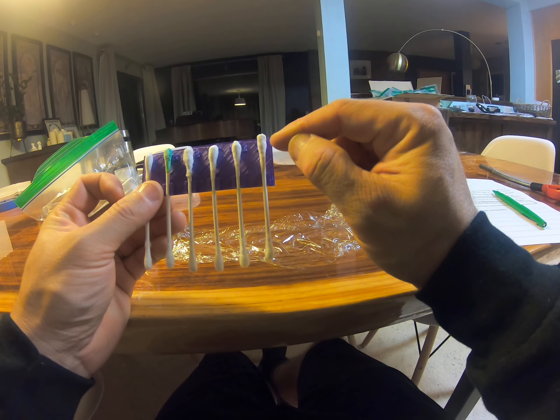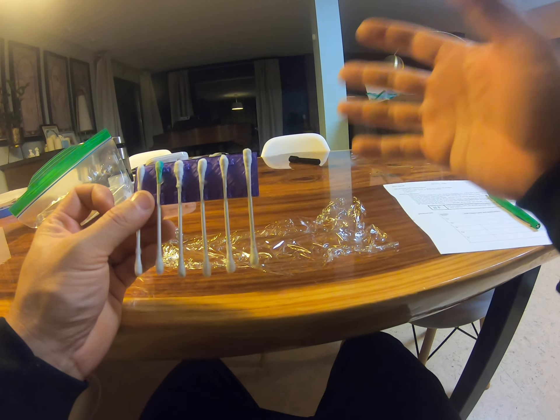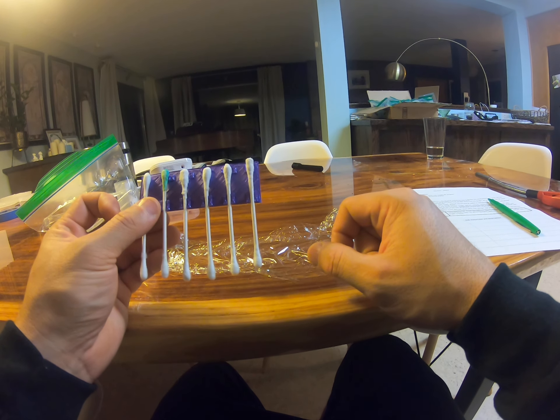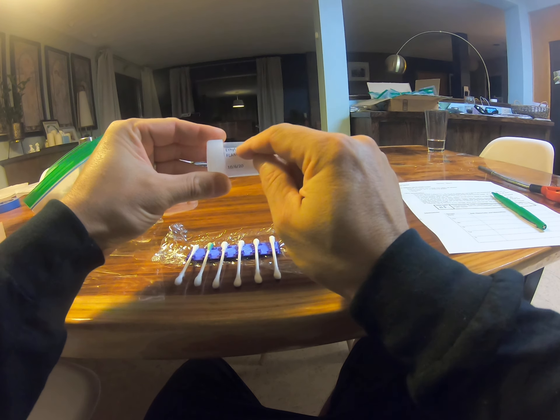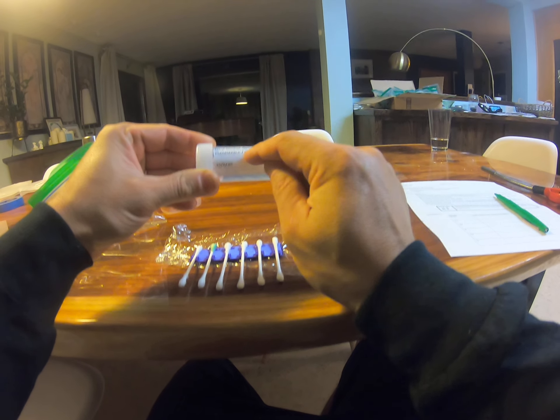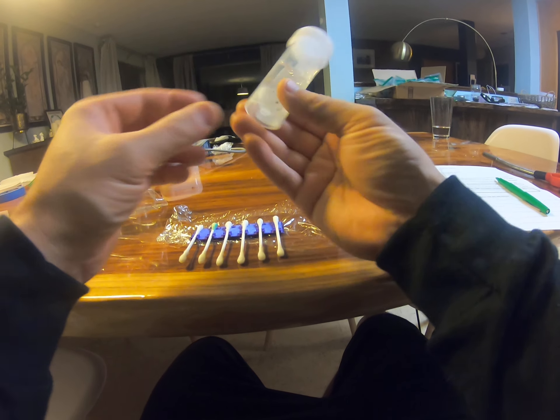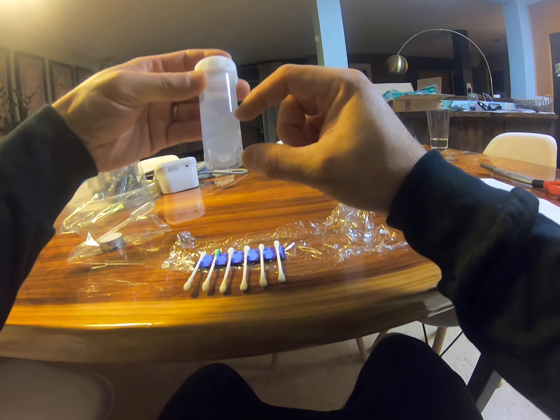And then these are our five samples: I have copper, barium, strontium, calcium, and lithium. That says CU for copper. You want to try and keep them in order so you don't mix them up. It's pretty easy to know which one's copper, but the other ones — most metal salts, most ionic compounds in chemistry, are white crystalline substances. So it's really hard to tell them apart. Please keep them in order. That's why I've got them wrapped in saran wrap, also to keep them dry.